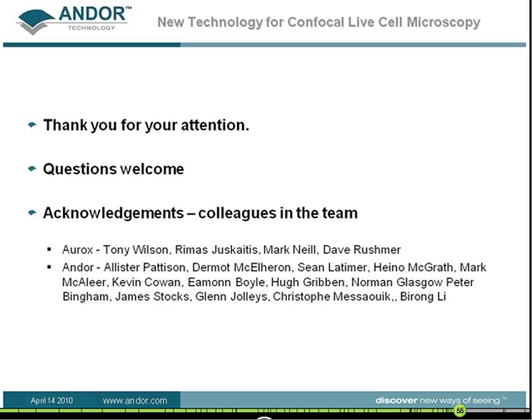Thanks a lot, Mark, for a great presentation. We have just a few minutes left, so we better move on to the question and answer session right away. So the first one in the list is, how straining is the system to the specimen? The questioner asks, I guess you need basically twice the excitation light hitting the specimen for the same amount of signal?